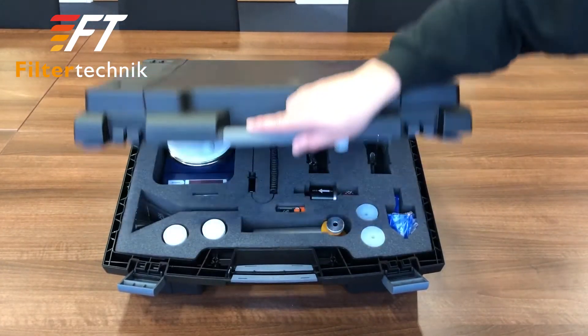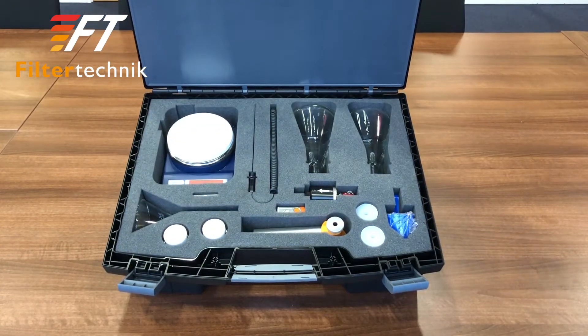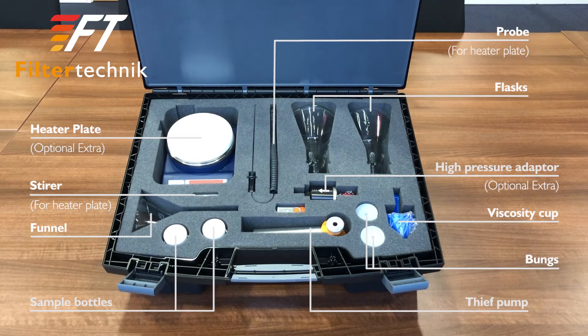This is the accessories case. This includes the flasks, viscosity cup, bungs, sample bottles, bonon, thief pump and optionally the heater plate with the stir and probe and the high pressure adapter.